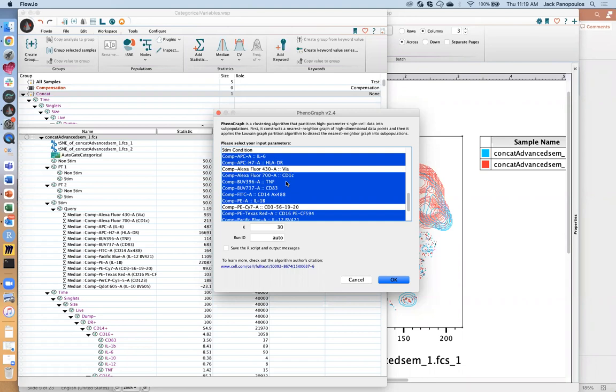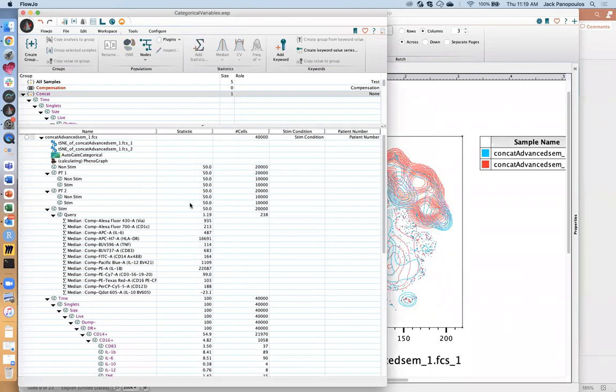A lot of times I go through my gating and I'm like, this is positive, this is negative. I don't really care if there's something in the middle, or if there is something significant in the middle, maybe I'll gate on it, right? But if I had to do that for every 2x2 combination, I'd probably pull my hair out. So these algorithms are really nice at pulling out some of those mid-state populations, and at least give you something to look at. Who knows? Maybe there's a phenotype there that is driving the differences that you see in the data set.